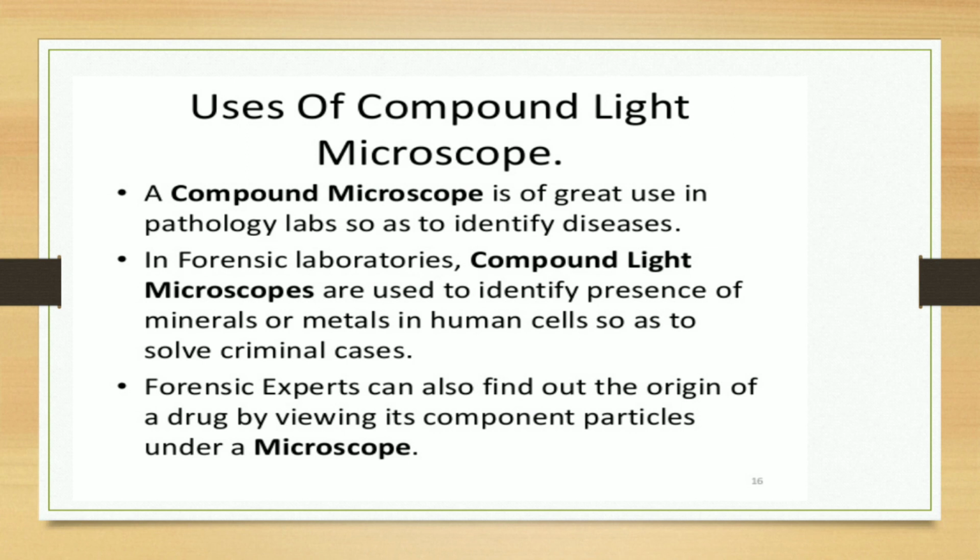A few uses of the compound light microscope: First, the compound microscope is of great use in pathology labs to identify various diseases.